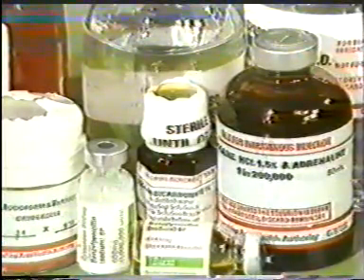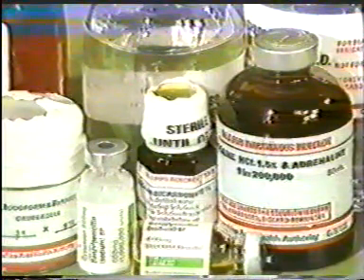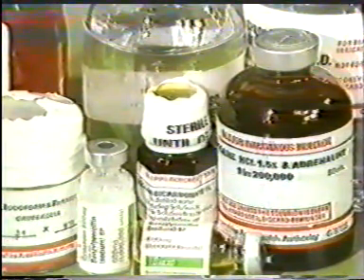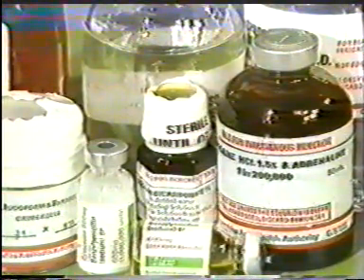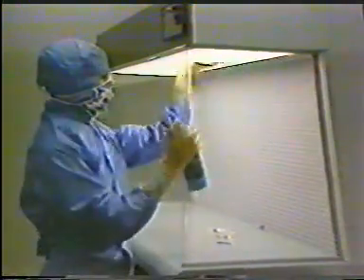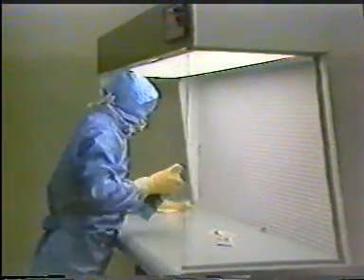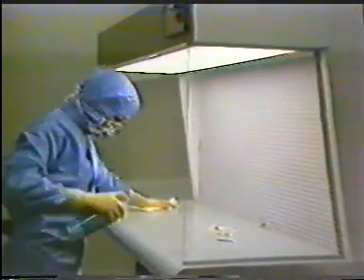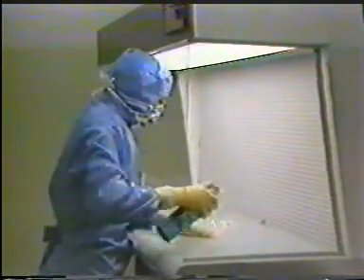Sterile production is more critical than non-sterile in that the final product must have no microbiological contamination and a minimum of particulate contamination. To achieve this, the environment in which preparation is carried out has to be very carefully controlled. Laminar airflow cabinets should be swabbed out before use with a bactericidal solution to minimize contamination, and they should be also switched on at least half an hour before work is begun.